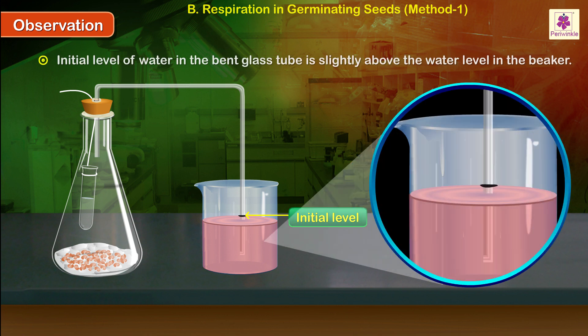Observation: Initial level of water in the bent glass tube is slightly above the water level in the beaker.